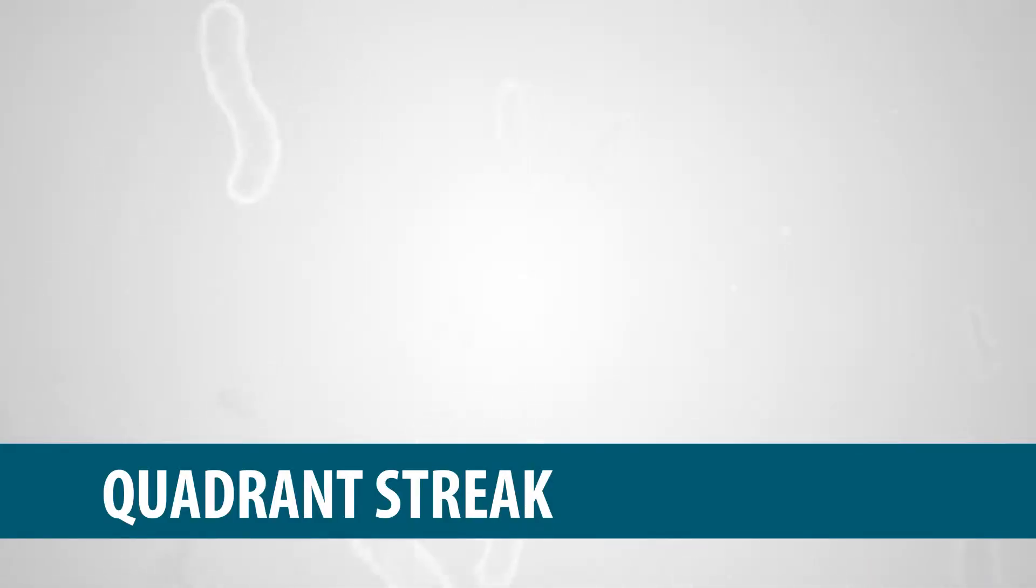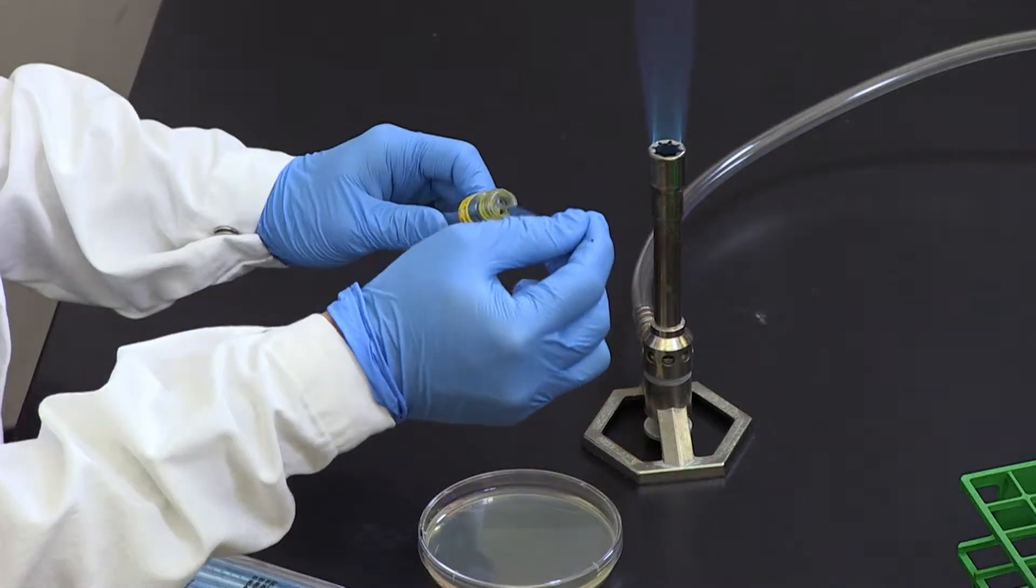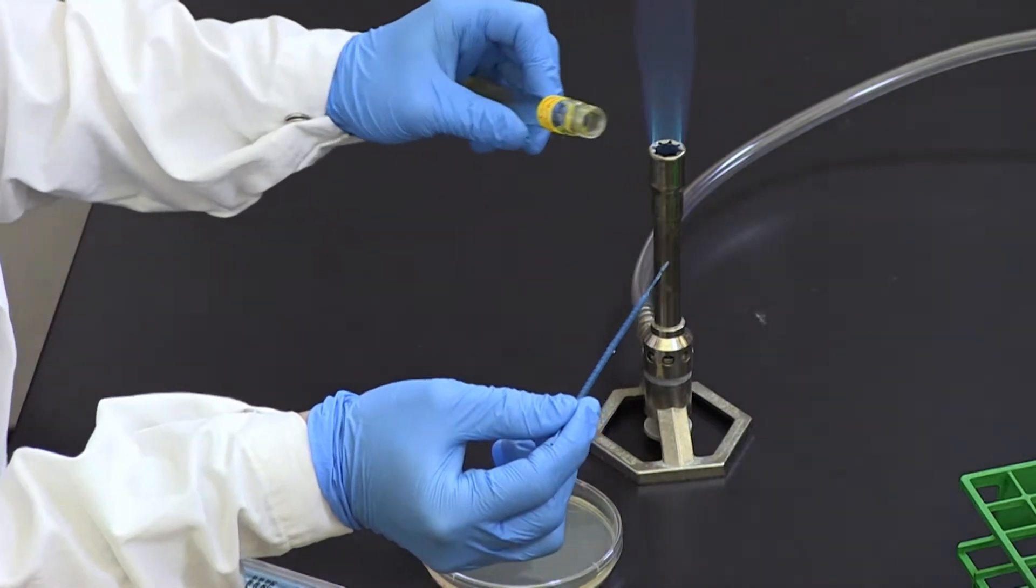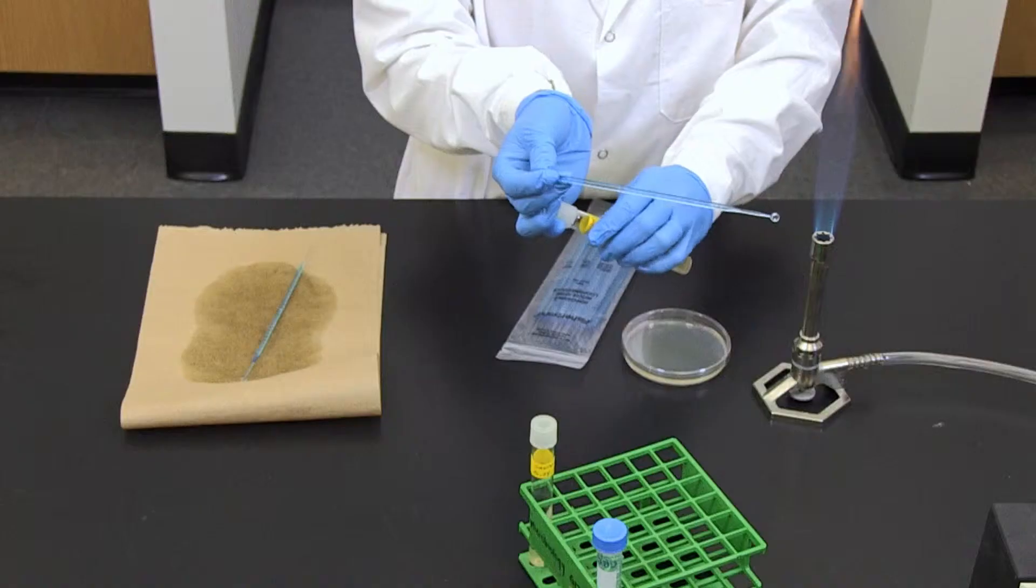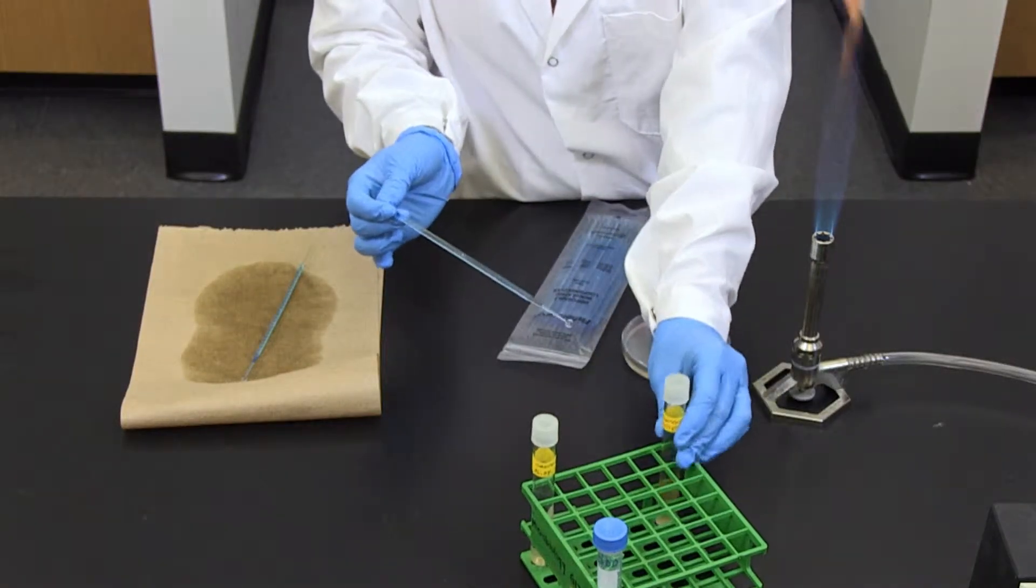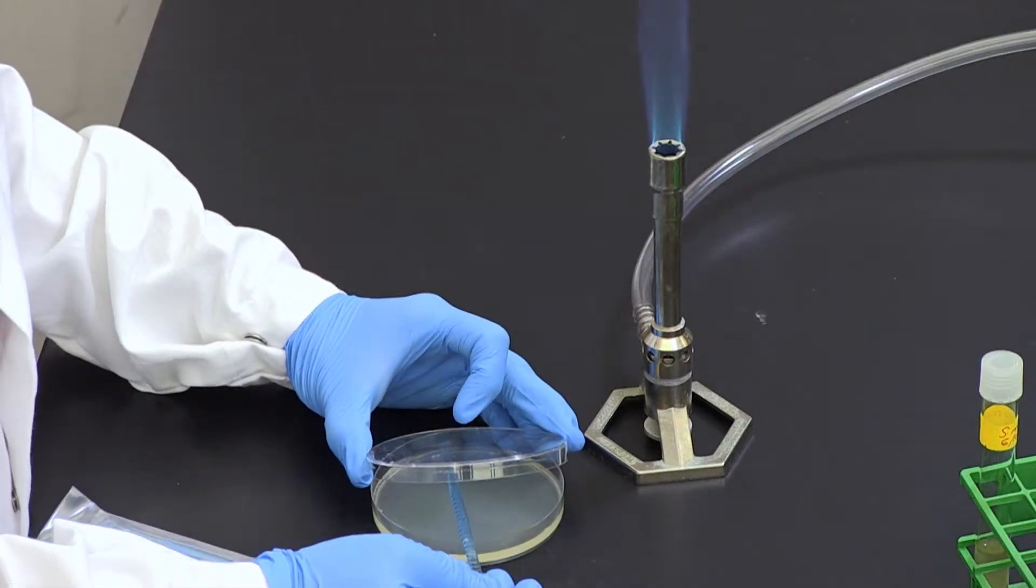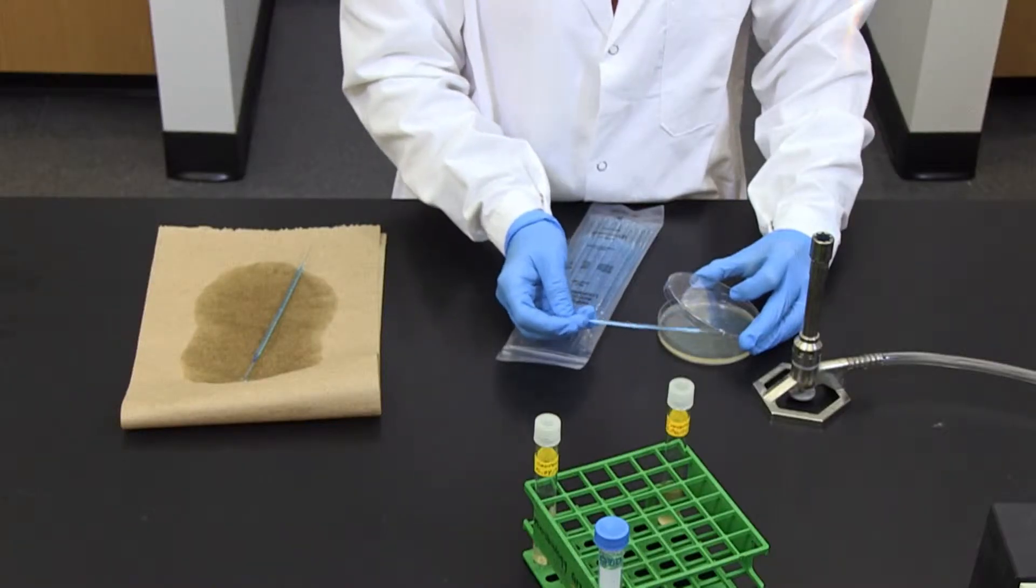Quadrant Streak. First, apply aseptic technique, streaking an inoculating loop full of microbes from a mixed culture back and forth over area 1 once. Apply lightly to avoid gouging the medium.